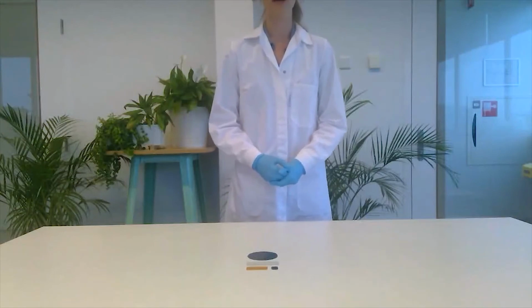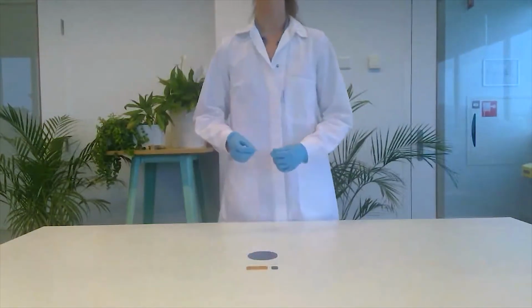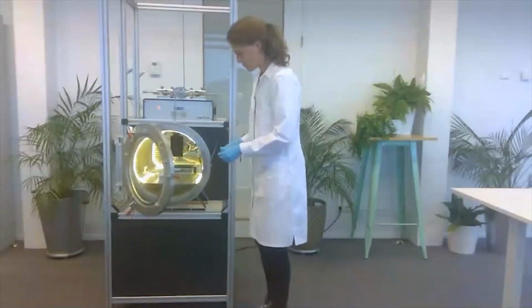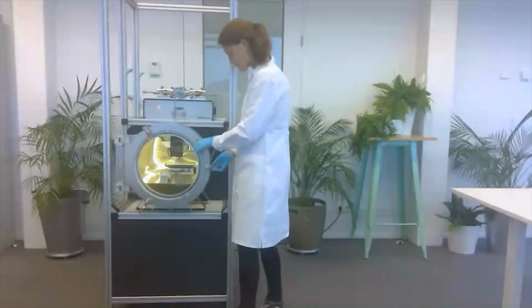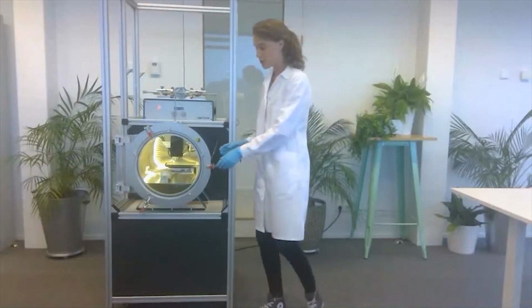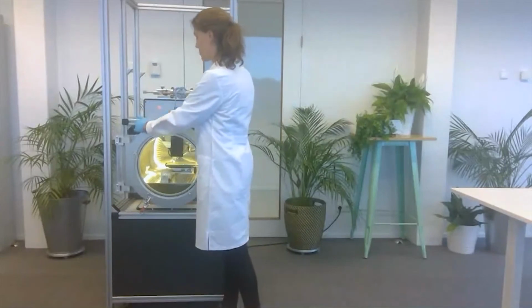I will show how to print a simple pattern on this glass plate. So let's go to the printer. I placed the substrate in the printer and will now close the door tightly so no air can come in during the printing process.